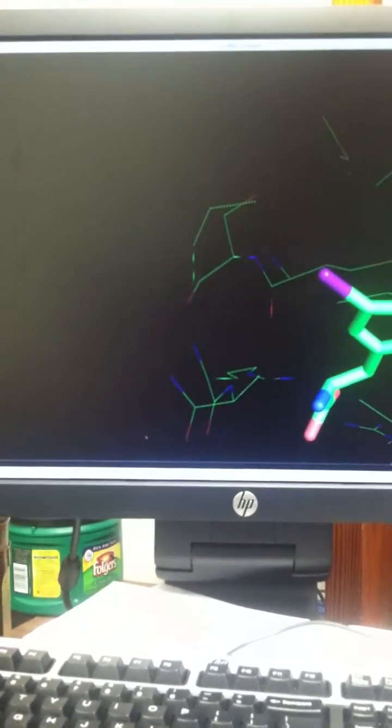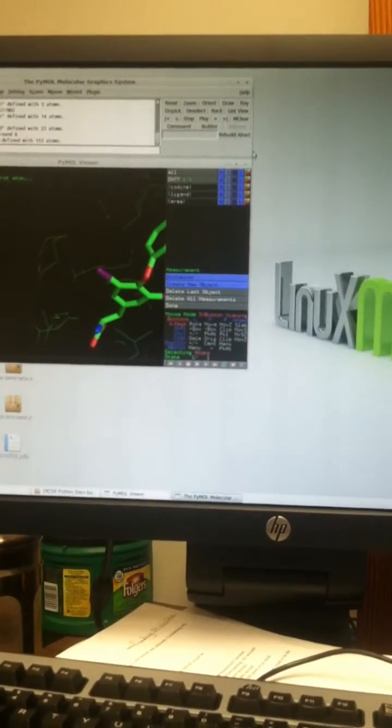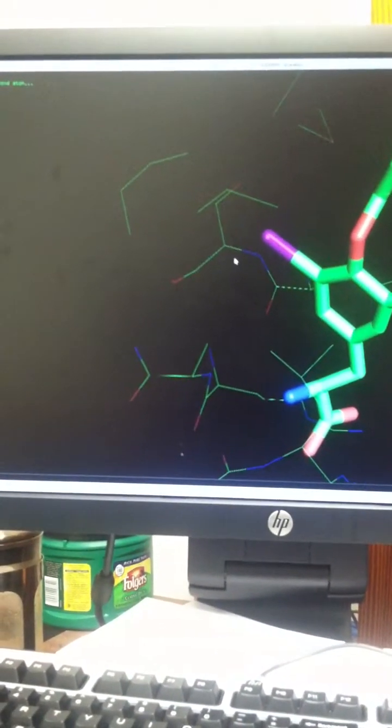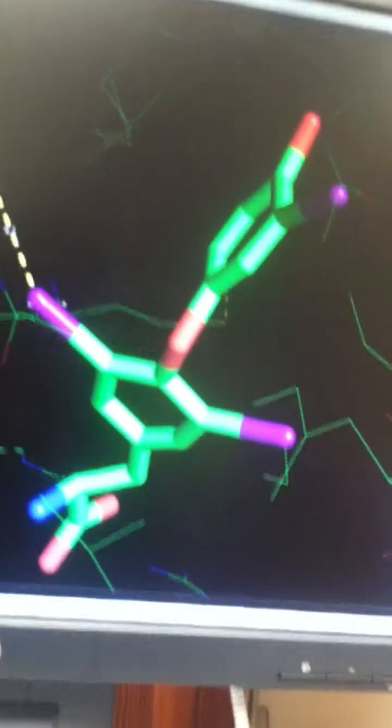So we have to minimize this. Pull up the wizard and pull up measurements. Okay, now make it bigger again. Click this. Click that. Bam, 4.1. Now see, that's a good one. We want 4.1. We want something close like that.